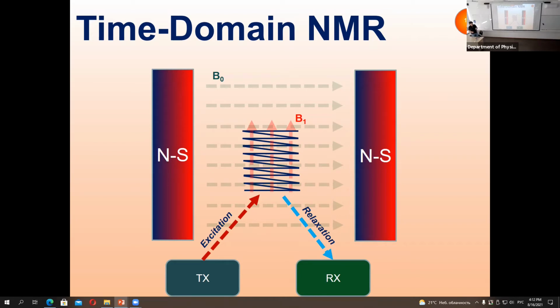Here I already start to talk about the technology. So the magnet must be somehow homogeneous. For high resolution, it must be very homogeneous. Transmitting pulses, excitation pulses, must be extremely strong. And then the reception, acquisition. Normally you build a resonance circuit, and the voltage on the coil during the pulse can reach a few kilovolts, really high voltage, and you need to use very expensive capacitors, otherwise they will just be broken immediately. So out of some kilovolts, you get the reply.